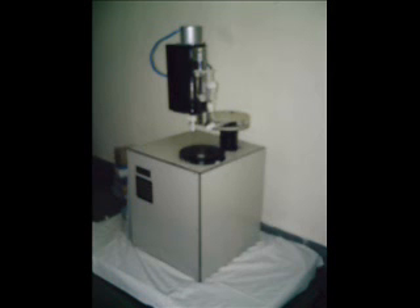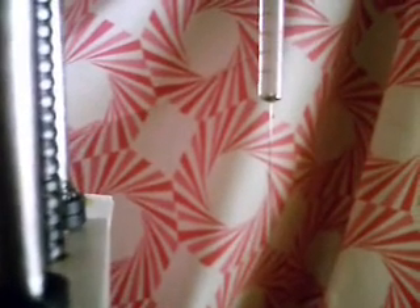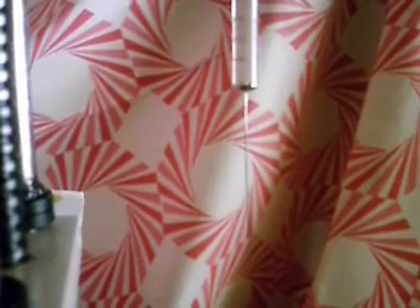The Indianized GC Auto Sampler has been designed to use standard gas chromatography syringes and to fit all popular Indian GC machines. Fitted with a rotary turret, it has a sample space of 8 samples.